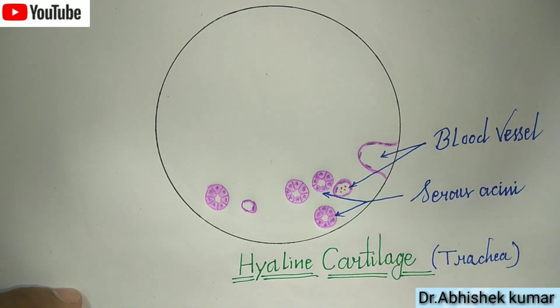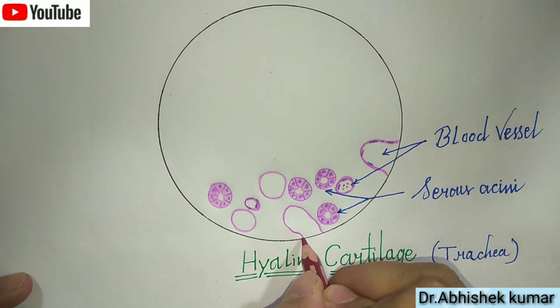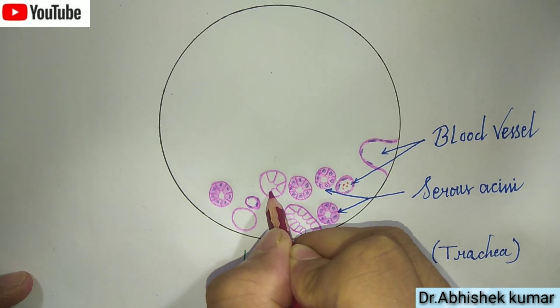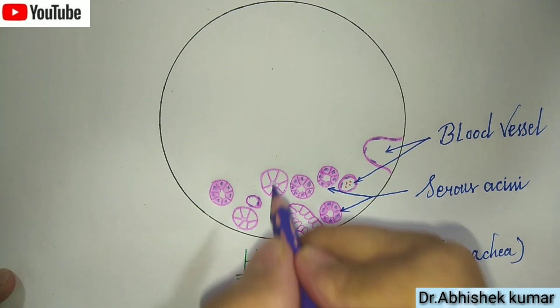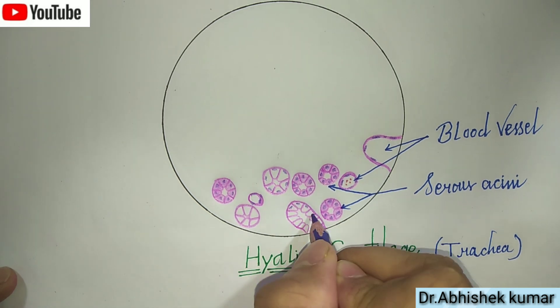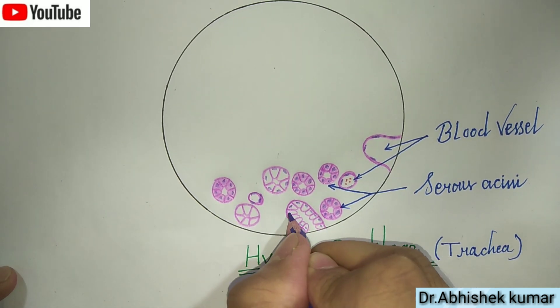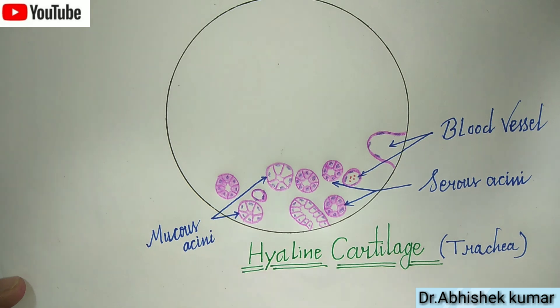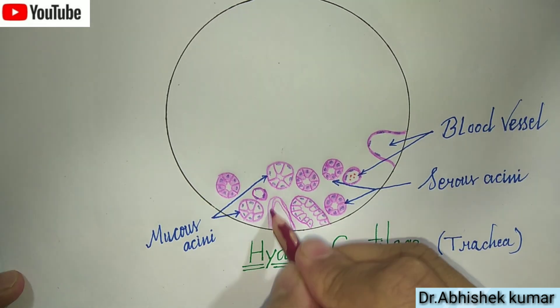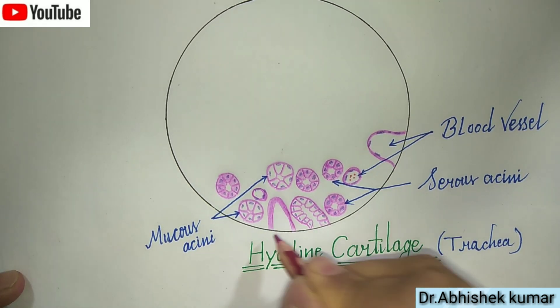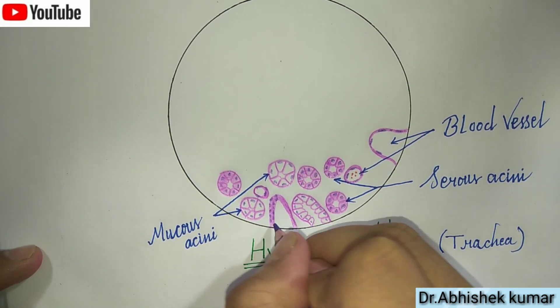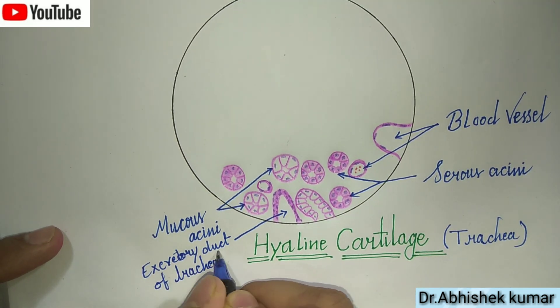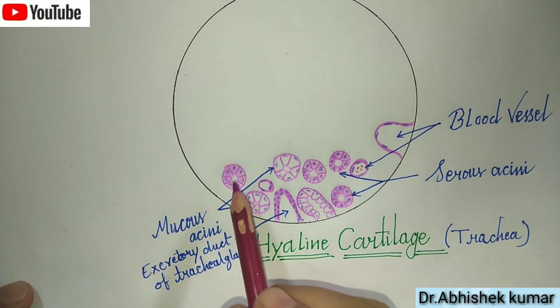This is the serous acini present in the histological diagram of trachea. Here is the mucous acini, and here is the excretory duct of the tracheal gland.